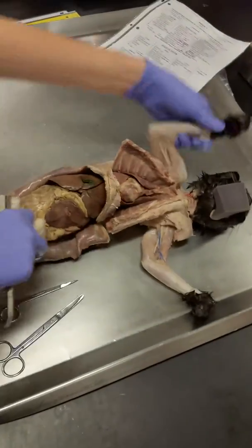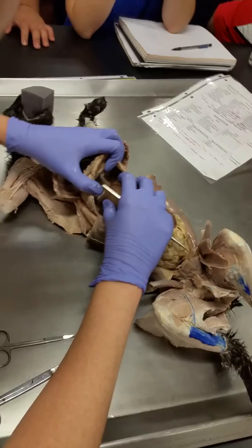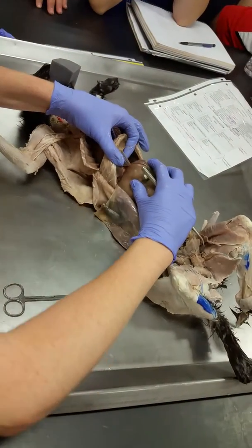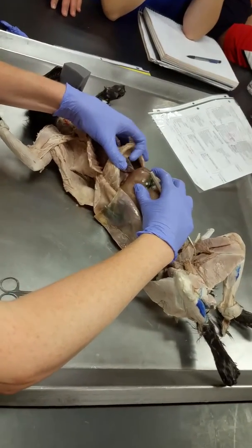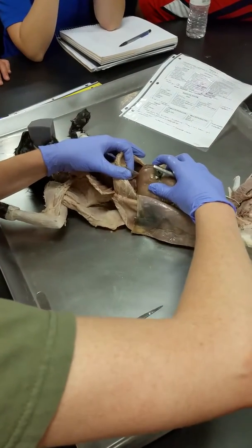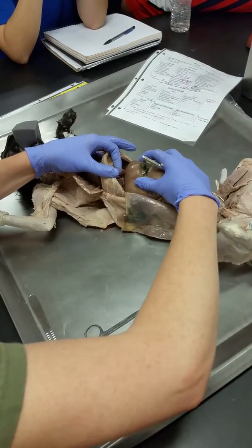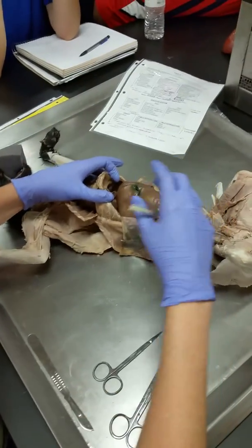Turn my kitty around. This thing right there attaching the liver to the diaphragm, that's falciform ligament. It's made of ventral mesentery. Okay. So on an exam, I could ask you, what is this structure? Or I could ask you, what structure was this in an embryo? Okay. And in an embryo, it was ventral mesentery.